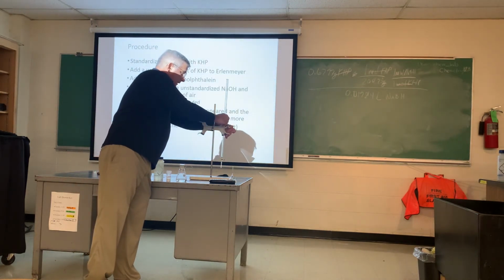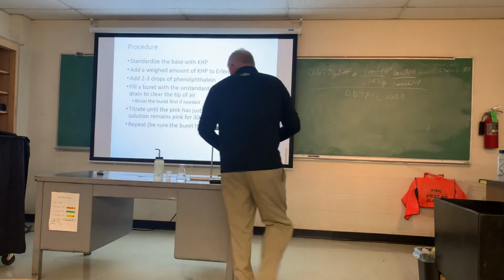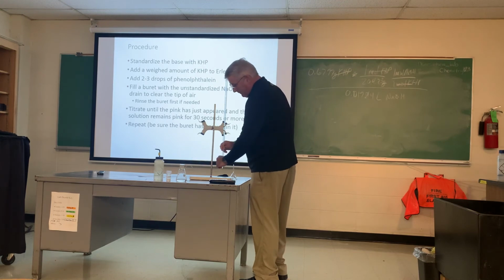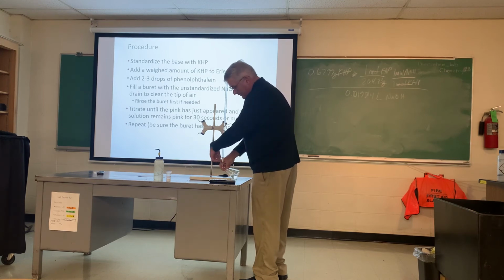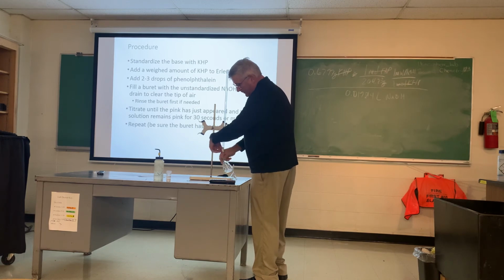Now, technique-wise, when I'm titrating, normally I titrate where I can see my flask, right?